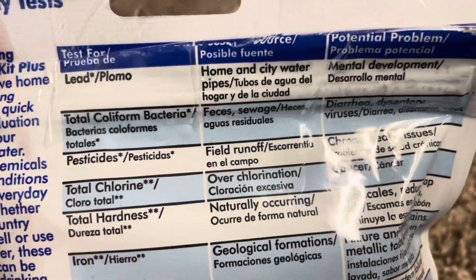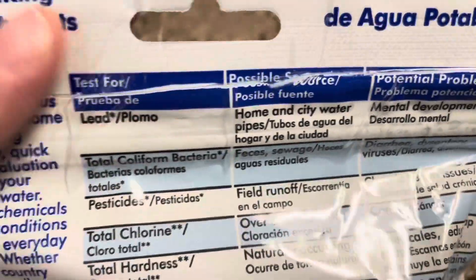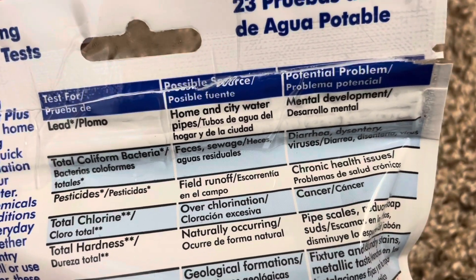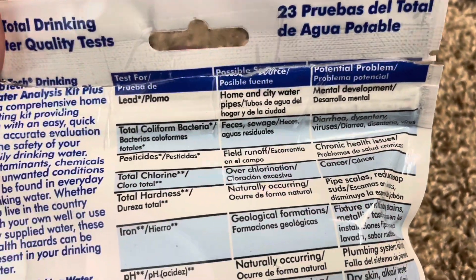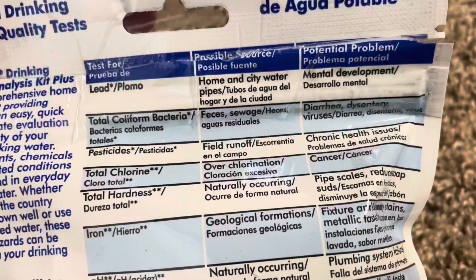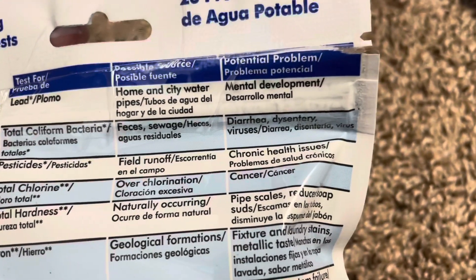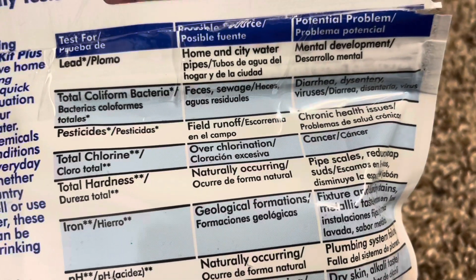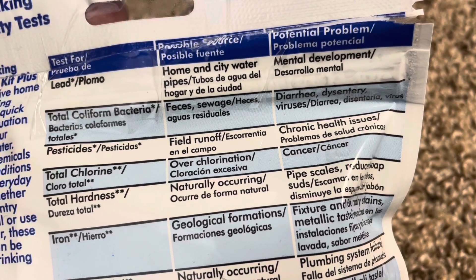It tests for lead — possible source: home and city water pipes. Total coliform bacteria — possible source: feces, sewage; possible problems: diarrhea, dysentery, viruses. Pesticides — possible source: field runoff; possible problem: chronic health issues.